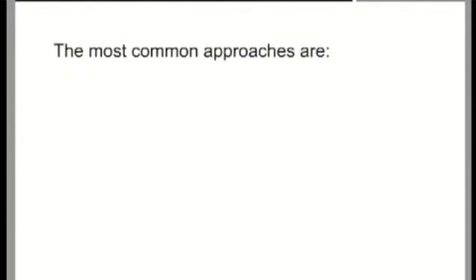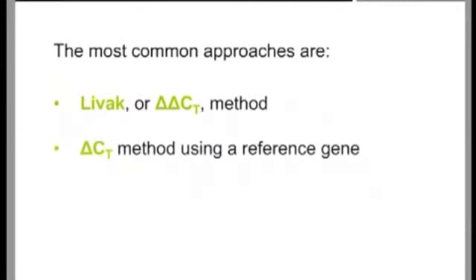The three most common approaches to normalization against a reference gene are the Livak method, also known as the delta-delta CT method, the delta-CT method using a reference gene, and the Pfaffl method. Each method has its advantages and disadvantages, as well as assumptions that must be met.